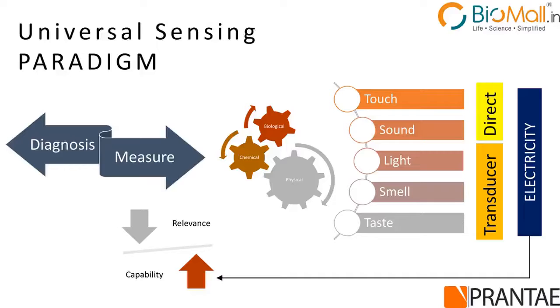Now, light cannot be measured directly because we really do not have mechanisms of measuring it directly. Any sensing system that we have these days relies almost exclusively on some kind of electricity to be measured. It can be the voltage difference that is generated out of the signal or the current that flows out of the sensor, and that is what you actually measure. Now, for light to get converted to electricity, you need to transduce it via something.